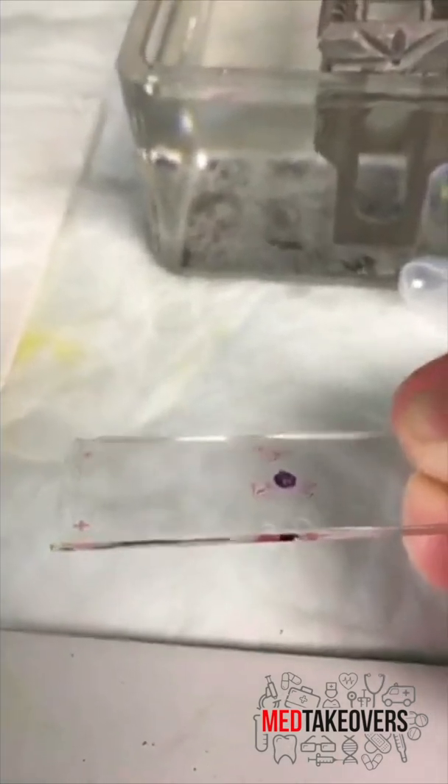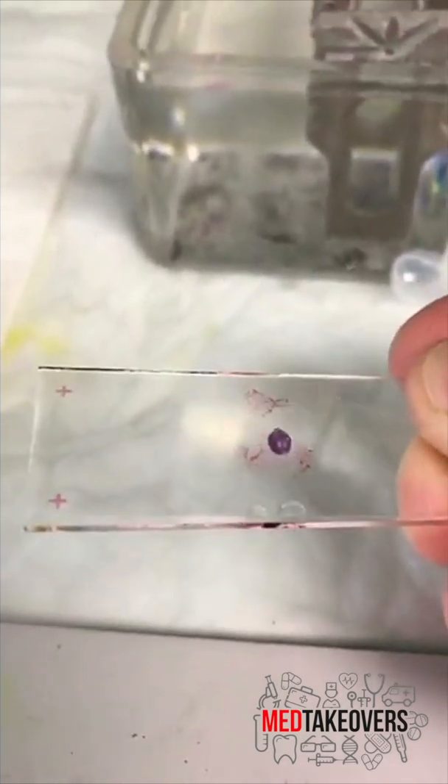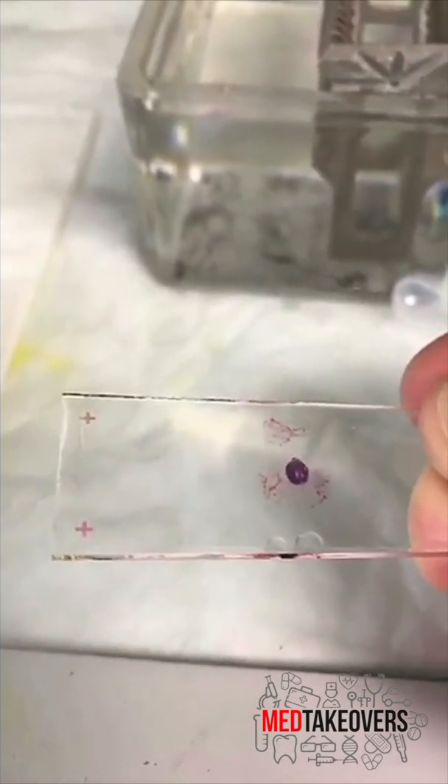After the tissue is stained, we apply a really thin layer of glass on top to protect it so it doesn't scratch off — that's called a cover slip. And then it's ready for the pathologist to make a diagnosis.